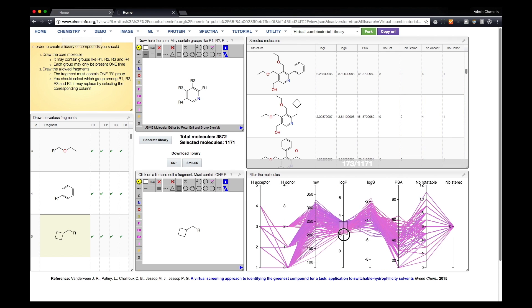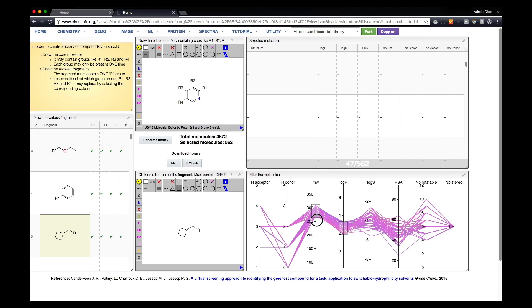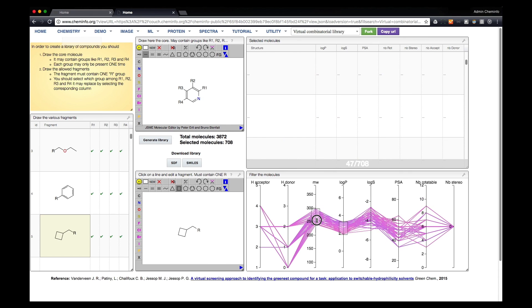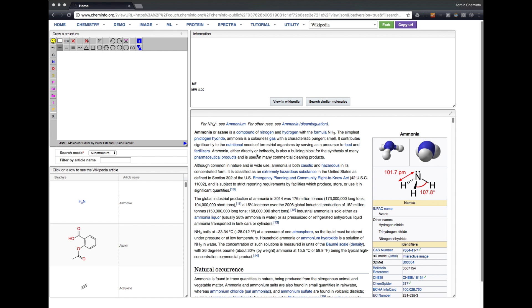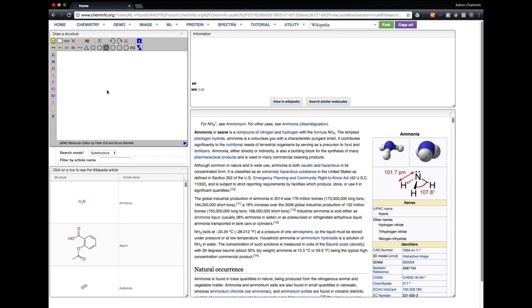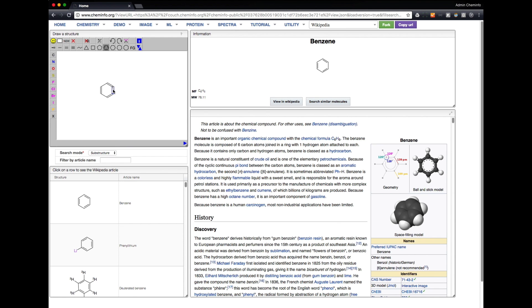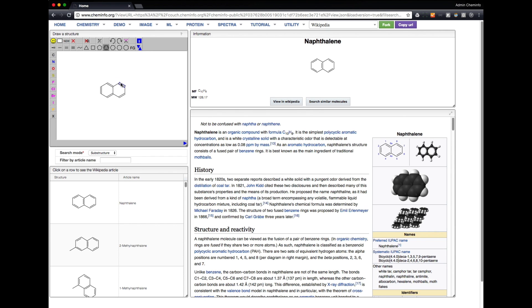We can also filter those molecules based on a parallel coordinate. Another application allows you to search for all the molecules that are present in Wikipedia by substructure. This is updated every night.